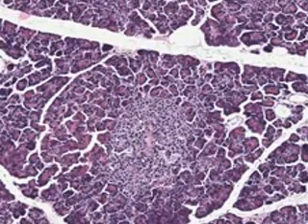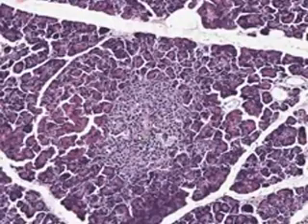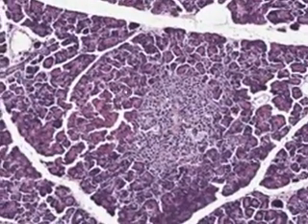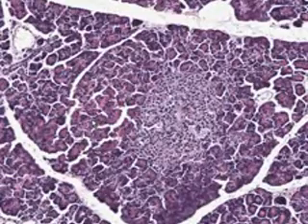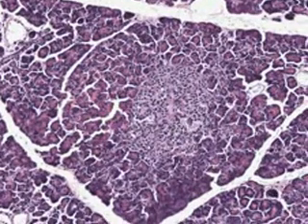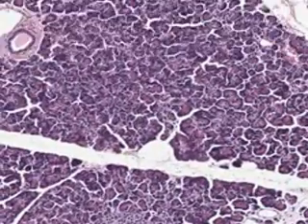Notice how it has no ducts or granules in it because it's strictly having the alpha cells, beta cells, so forth, secreting hormones into the blood, whereas in the exocrine portion of the pancreas, we have zymogen granules secreted into the duct system. Let's take a closer look at a duct and some of the exocrine areas.